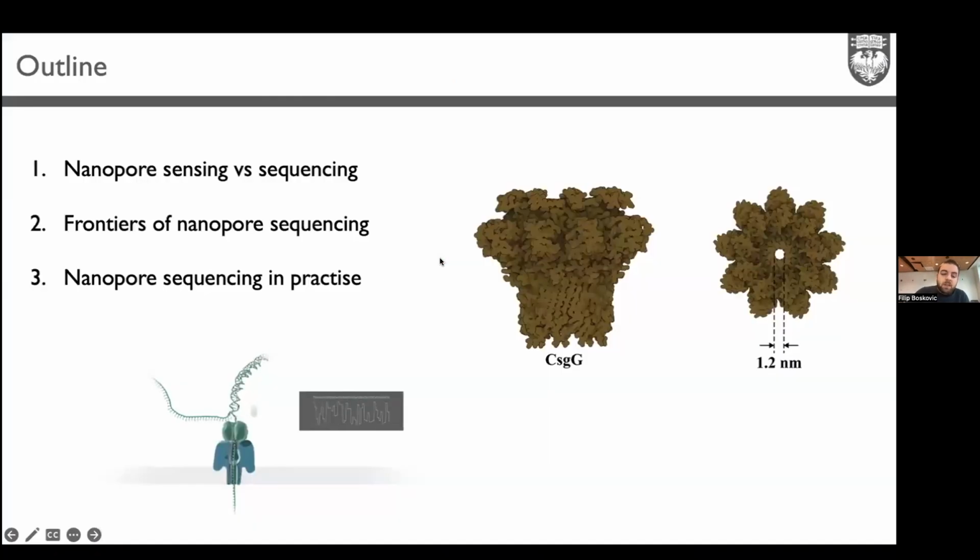So basically the outline of our talk would be the following. First, I'll tell you a bit more for you to understand what nanopore sensing is, what nanopore sequencing is, what nanopores are in general. Then we will talk about the current frontiers of nanopore sequencing, and I will give you some piece of advice on how you can start your own nanopore sequencing experiments as soon as possible.